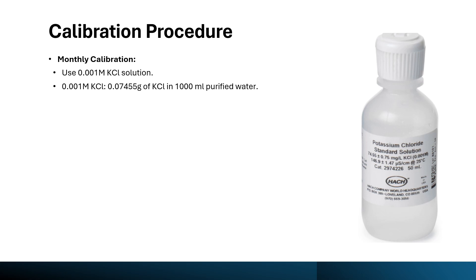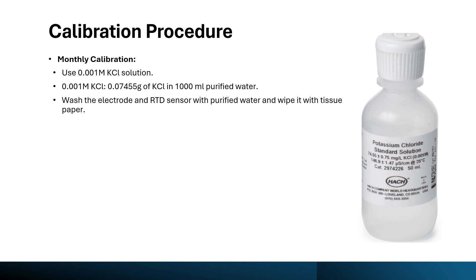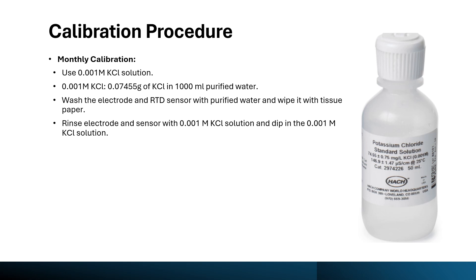This will prepare the 0.001 M KCl solution. After that, wash the electrode and RTD sensor with purified water and wipe with tissue paper. Then rinse the electrode and sensor with 0.001 M KCl solution and dip into the 0.001 M KCl solution. Before taking the reading, rinse the sensor and electrode with the KCl solution for saturation purposes.